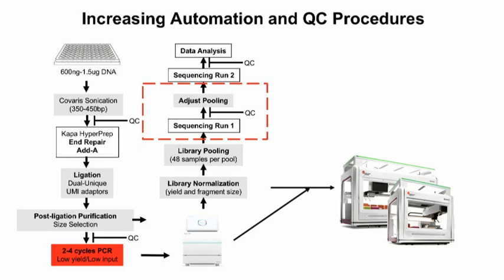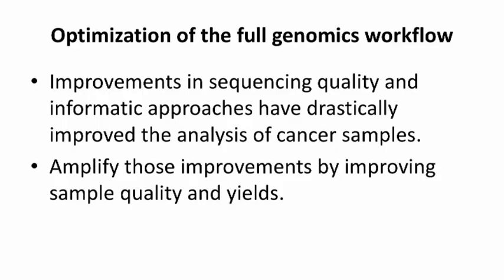But it's also not unusual that we'll do one single run for the germline samples, which is why the data off of the iSeq turns out to be very informative, because we can adjust pooling before going to the production run, which again works very, very well. So if you're running at least 96 samples on this and you're buying these from Illumina in the 4-packs, in our hands at least, it's pretty equal in cost per sample to Kappa. I think everybody's mileage may vary a little bit there depending on how you do costing and some of the other considerations.